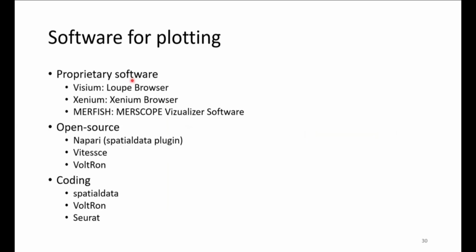We already heard about some proprietary software by 10x, like Visium and Xenium. Really nice if you use their systems. There's one by Vizgen as well for their software. Really nice if you use their system.